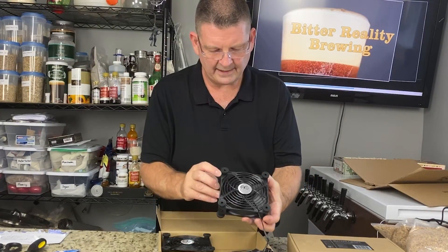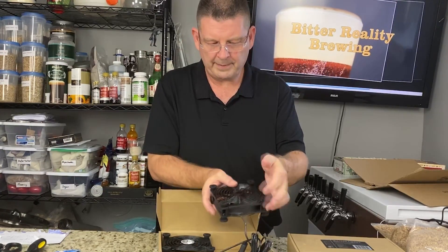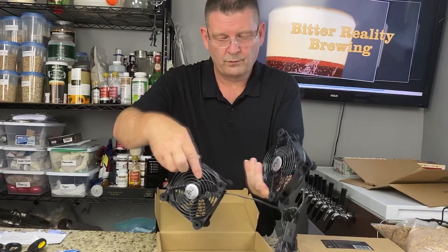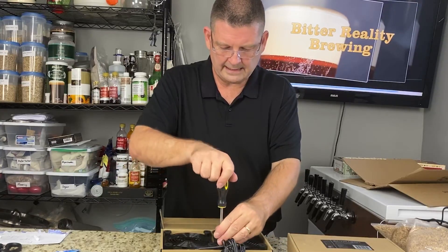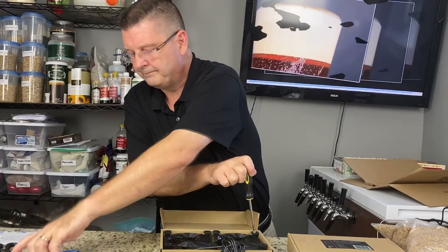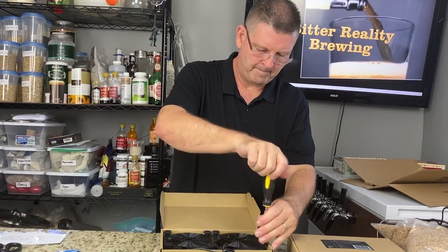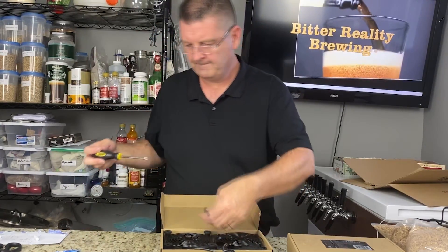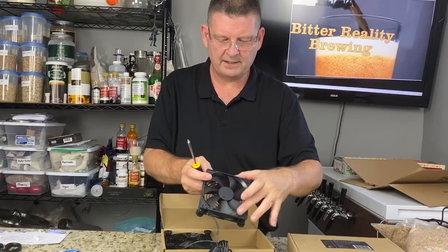If you look at the fan, you're going to see on the top there's a hard casing piece — you don't want that. Flip them both over. On the bottom it says AC Infinity. Take that side off — all these are is little rubber bumpers. You don't need them on top, only on the bottom, and I'll explain why. Take the grill off — plain black grill. Now you can see and expose the fan.